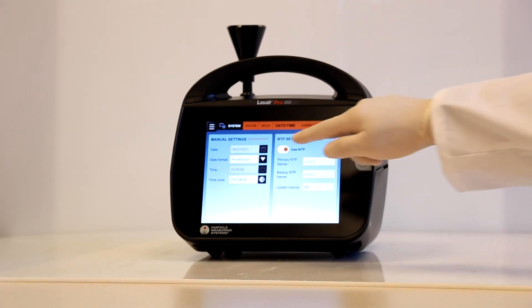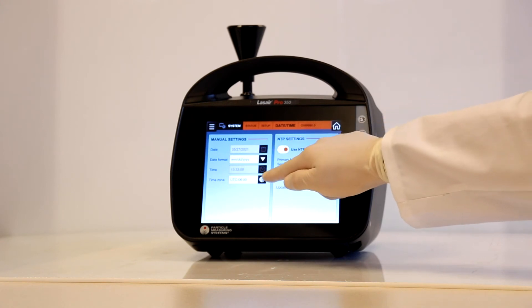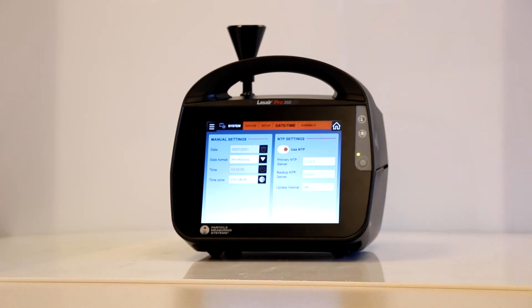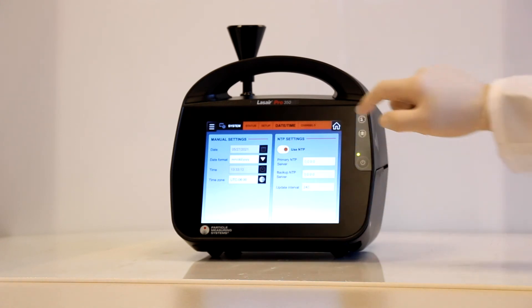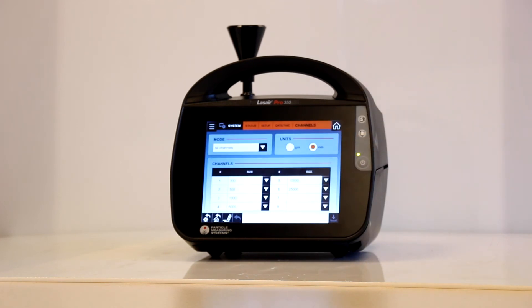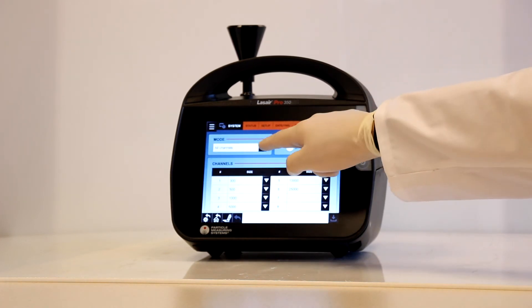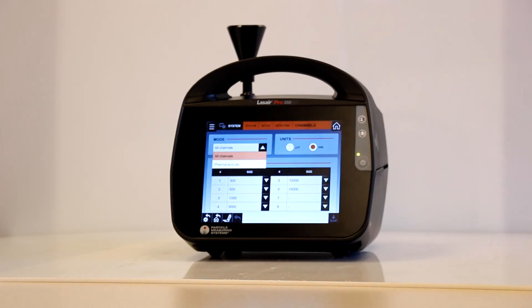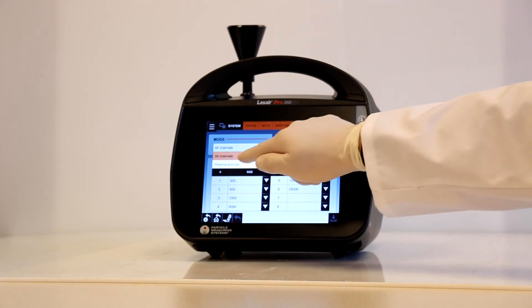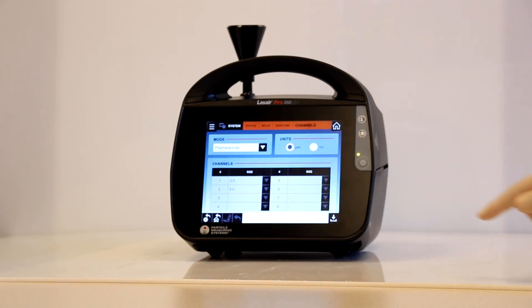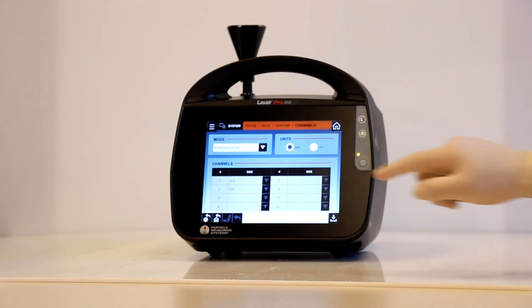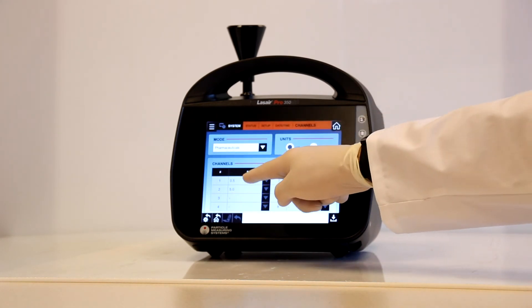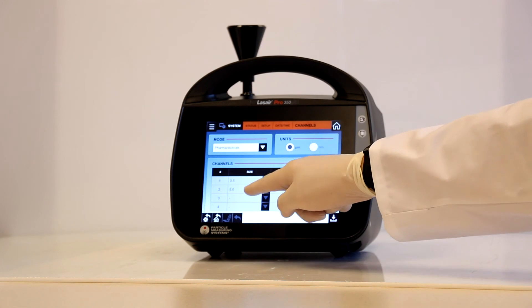When using NTP, you can still select the date format and time zone. The final tab in the system setup is the Channels tab.